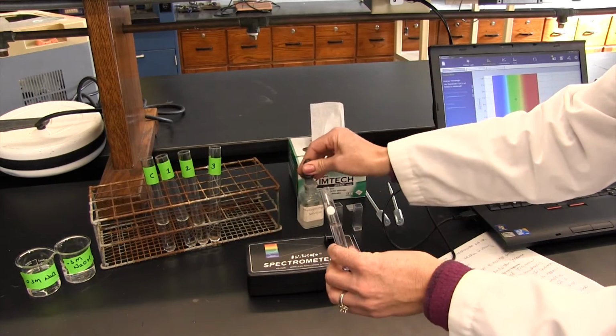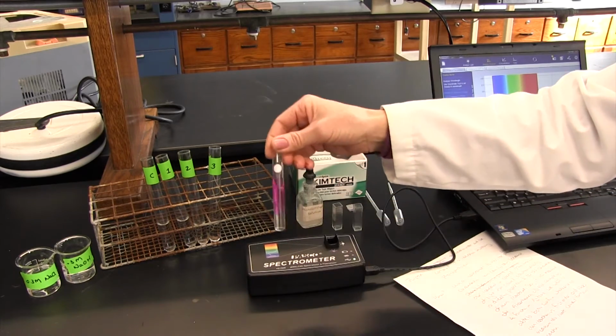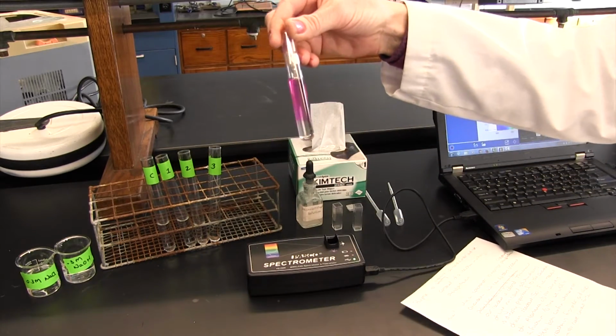So if you look here, I'm just going to add a couple drops. You can see our reaction is pink. Our reactant is pink.